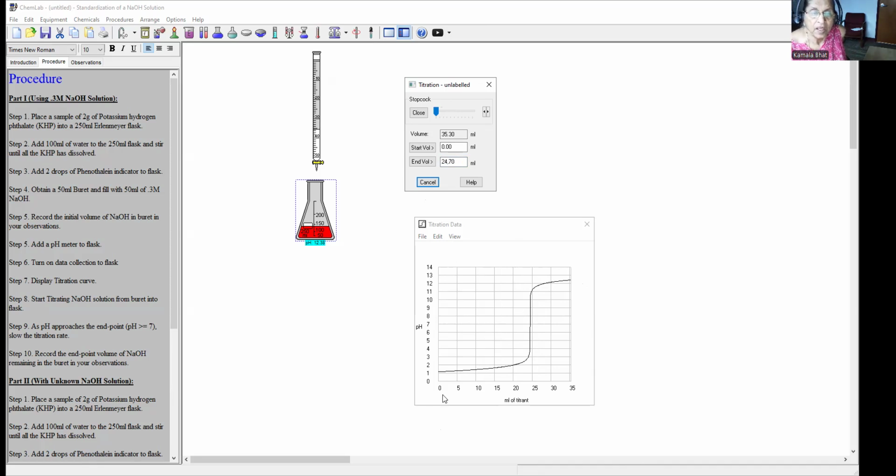Now, at the neutralization point, the pH will be 7. So you just use your ruler and then plot it down below and see where exactly it hits the titrant axis. Now, how do we find where exactly is the midpoint? So you make sure that the straight line portion is used to measure the volume. So this is how you calculate.